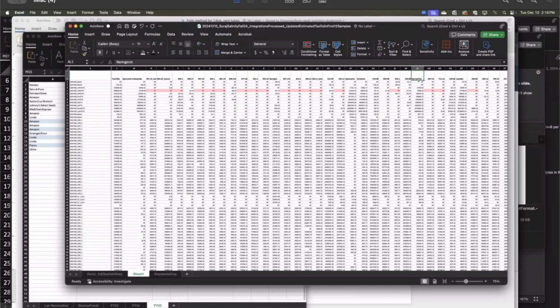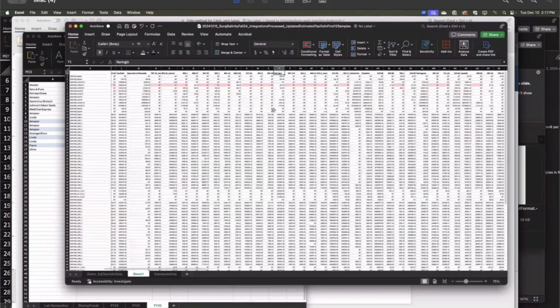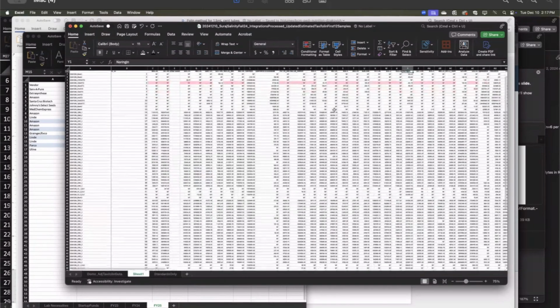Naringenin is more semi-polar, whereas naringin is very polar. That gives us different ways of figuring out extraction efficiency depending on the compound we're looking at. Generally speaking, most of our compounds in our samples are very glycosylated and decorated, so we use naringin to estimate recovery. Okay, so these are all of the organized peak areas that we've put together here.